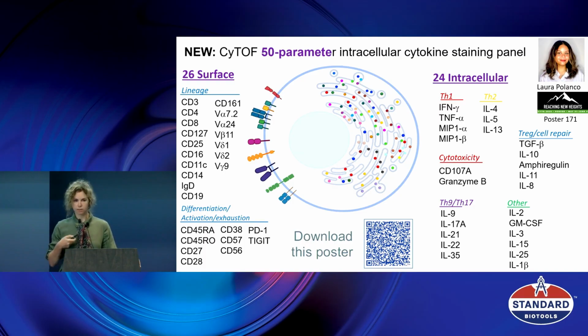But not only T cells, there are cytokines that are made by myeloid cells and B cells, and we actually have a few B-cell and myeloid cell markers in the panel. A lot of them we put there because we don't even know what they do, because there's no literature, because everybody is measuring interferon gamma and IL-4. So yes, we were absolutely open to exploratory findings.